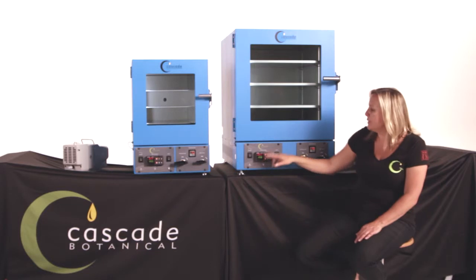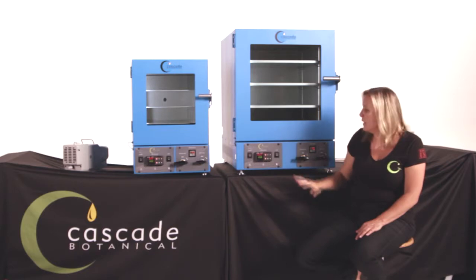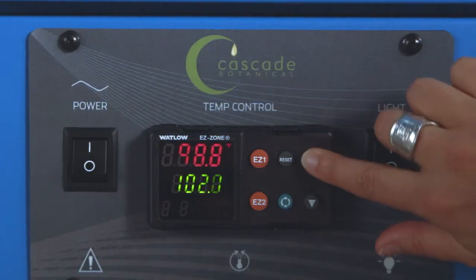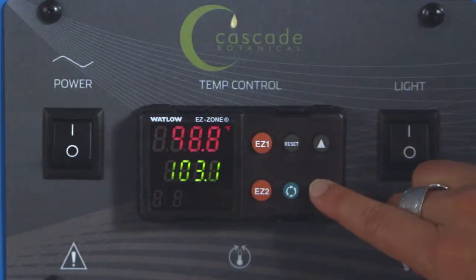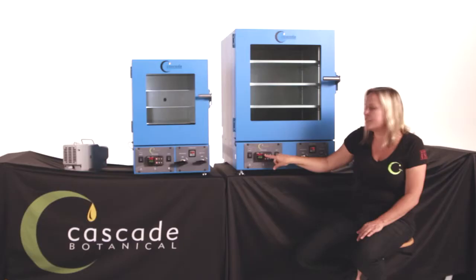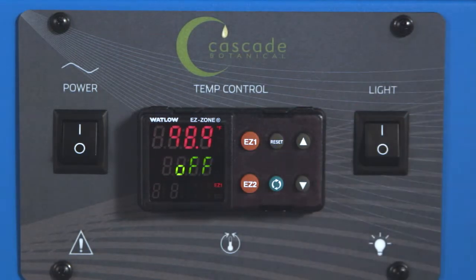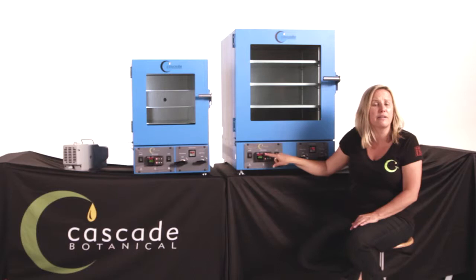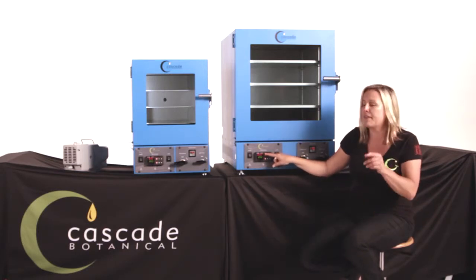The second thing we've done is we've added some additional features in the controller. For all practical purposes, our professional processors are using the up arrow to increase the temperature, the down arrow to decrease the temperature, and also this easy one-button that will help better control temperature uniformity and performance when you're doing things like flipping, venting, or opening or closing the doors. More on that later.